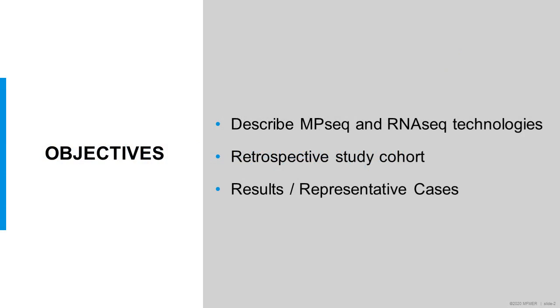First, I'm going to describe mate-pair sequencing and RNA-seq technologies themselves to give some background. Then I'll go into our retrospective study cohort, and then I'll run through two different cases that show synergy between these two methodologies.